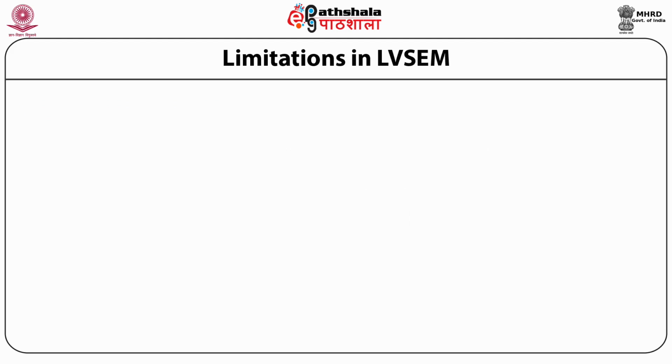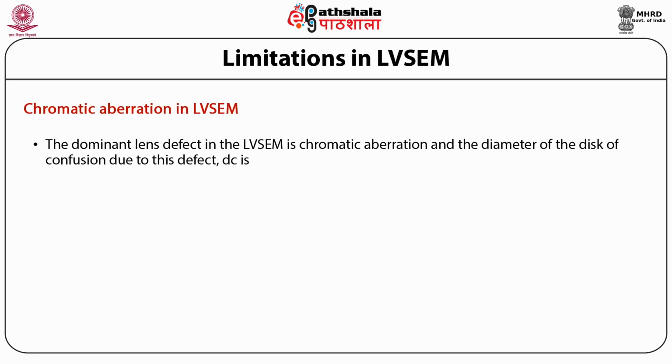The third limitation is the chromatic aberration in low voltage SEM. The dominant lens defect in the low voltage SEM is chromatic aberration.